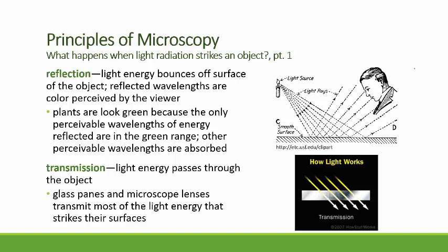But if we check out this image here, the top one, I love this image. It's awesome. So here's a light source. We've got a candle burning. The light energy strikes a smooth surface and then bounces off of it. And some of that light energy bounces into the dude's eye, and so he is able to perceive it then.